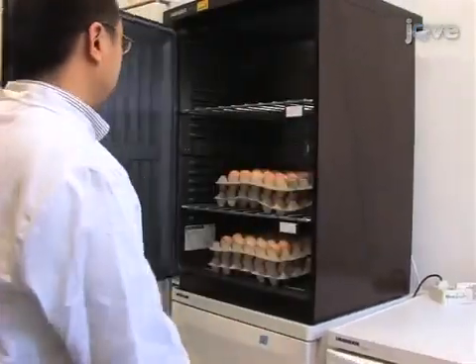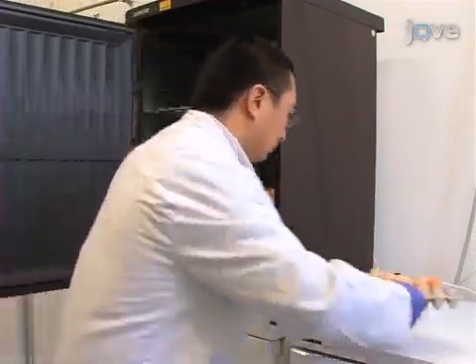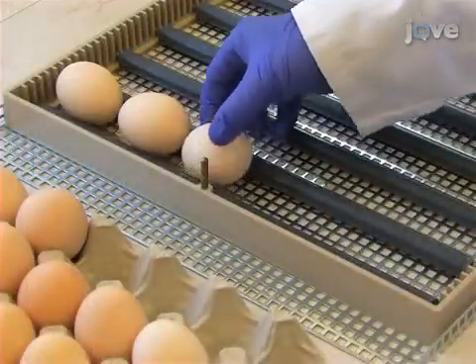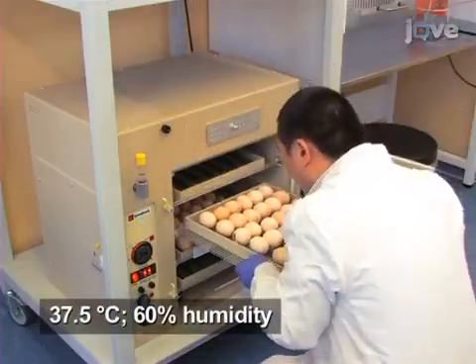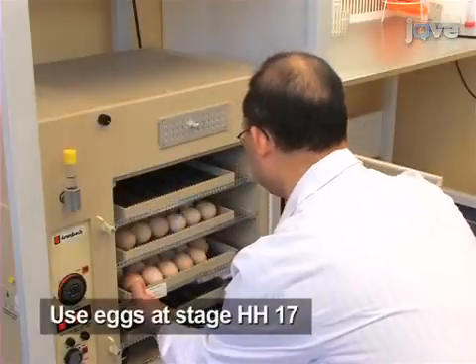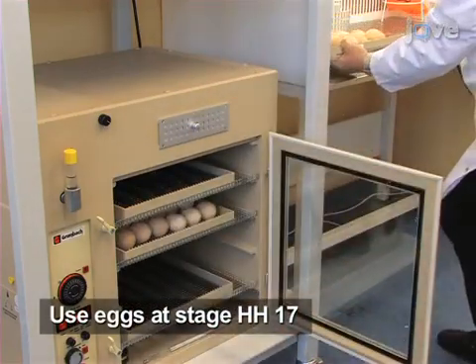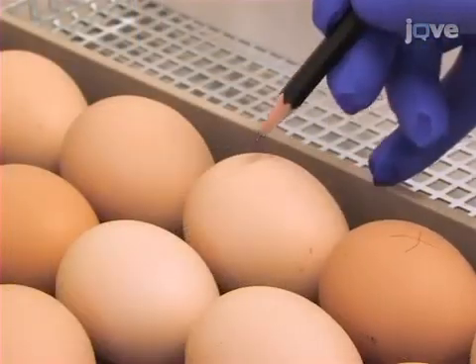Successful ex ovo culture of chicken embryos requires the use of fresh fertilized eggs. Do not use eggs stored at 12 degrees Celsius for longer than one week. Lay the eggs onto their long sides in a forced draft incubator at 37.5 degrees Celsius with 60% humidity. After incubation for 2.5 days, when embryos are at about Hamburger and Hamilton stage 17, take out the eggs from the incubator and label the top of each egg with a pencil to indicate the direction for cracking.